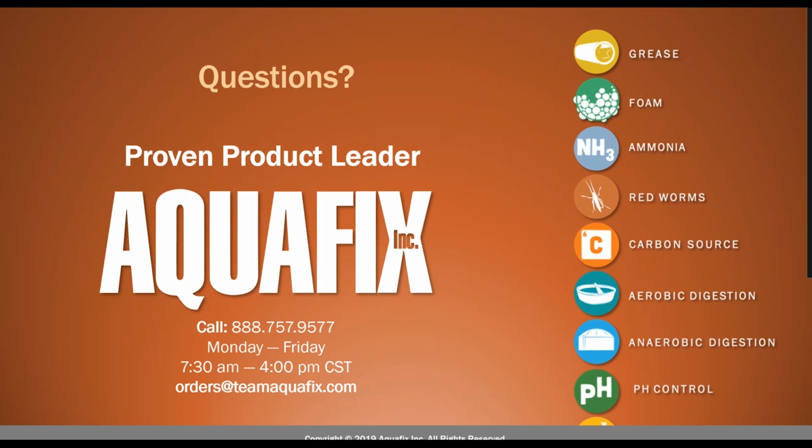However, it's important to know specifically what filament is causing foam if it is a filament-based foam. Because if we can determine that the filament that's causing the foam is nocardiiforms, then we can provide a specific treatment recommendation for nocardiiforms, where we want to be able to figure out what's causing the growth of those nocardiiforms that's causing the foam in order to really take a look at a treatment recommendation for the cause of that growth. And so really trying to fix the cause of the problem instead of just fix the problem, if that makes sense. So that's why it's so important to know the actual cause of foaming by microanalysis in order to provide a full treatment solution to be able to fix that cause rather than just knock back the foam temporarily.